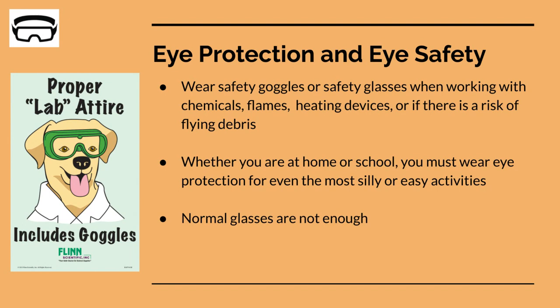Even for the most silly or easy activities. You'd be surprised just how many times people think, oh, I don't need to wear this safety material because there's no way I'm going to get hurt. And then usually they get hurt. Especially when it comes to your eyes, you need to wear eye protection. It's one of the biggest safety concerns in the lab: making sure that you can go home still being able to see everything.